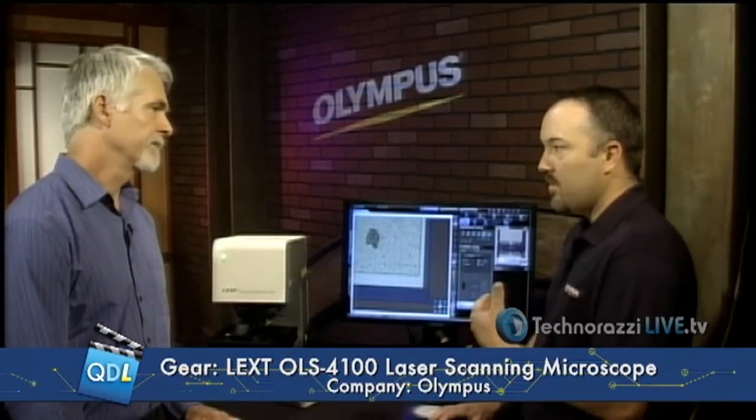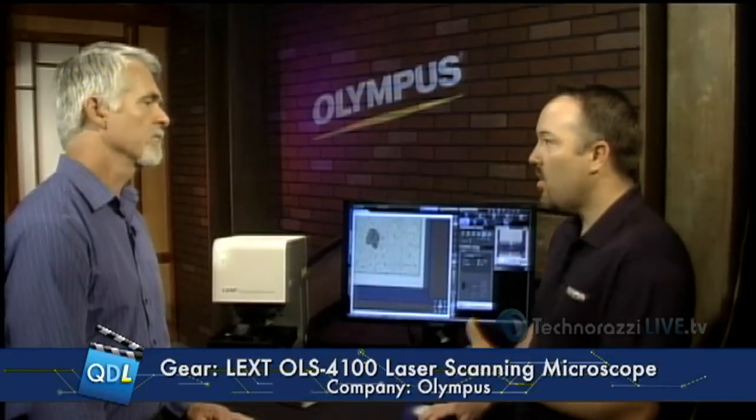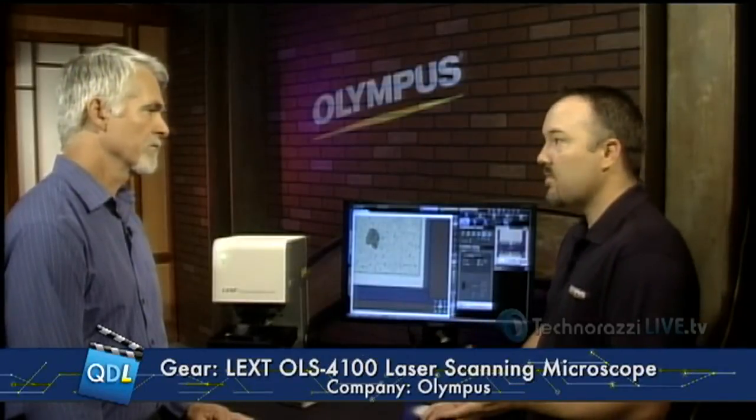Well, like Mike said, I'm here with Rob Bellinger from Olympus, and this is the OLS4100 — this is a microscope, is that right? Yes, it's a laser scanning confocal microscope to be exact. It's a precision measuring tool capable of very high resolutions and high magnifications as well. It's situated in the R&D and quality control type areas for its use.